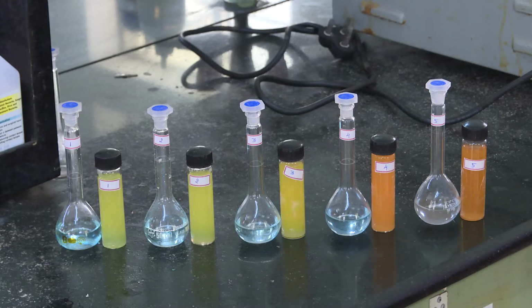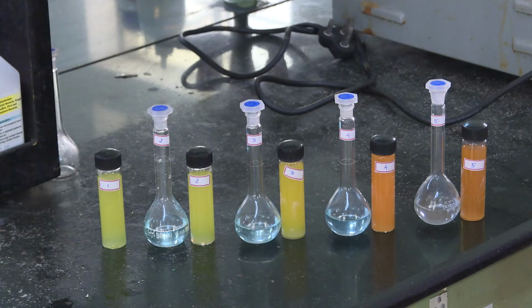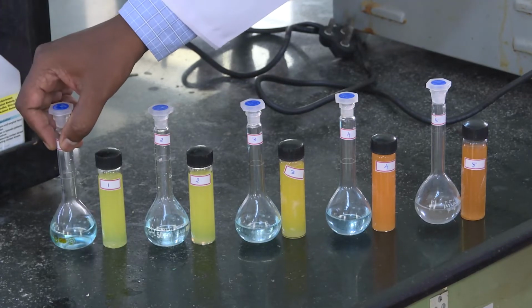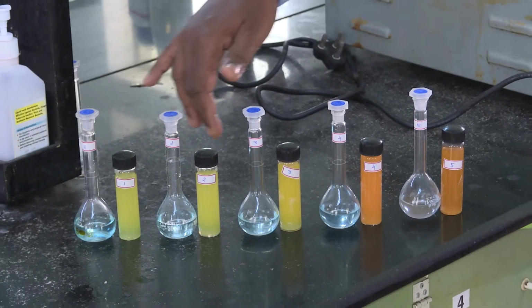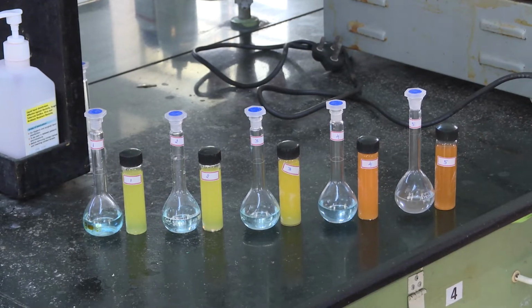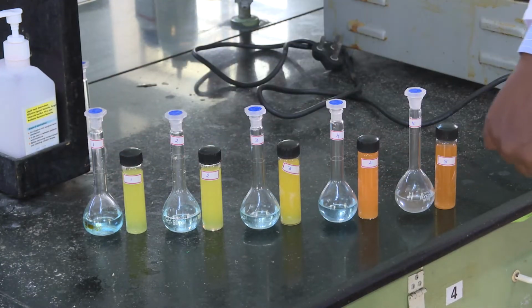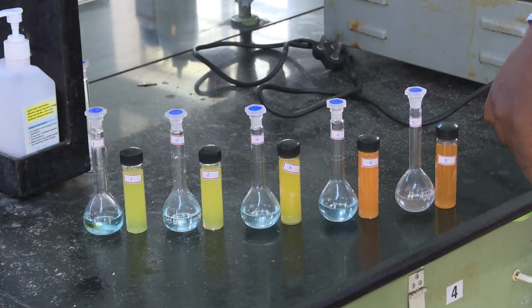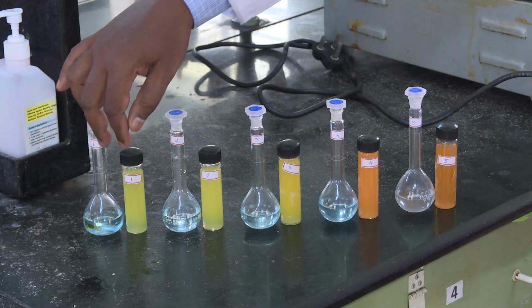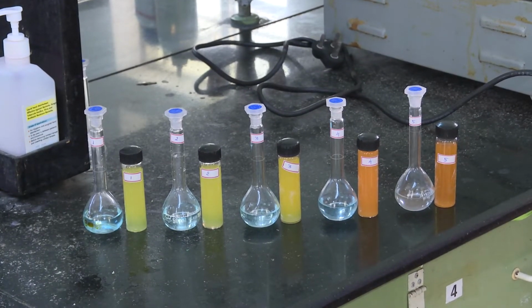Okay guys, after 5 minutes in the water bath, you can see that the Benedict solution, which was originally bluish green in color, has changed color for all of them after heating. From the lower concentration of sodium hydroxide, the color goes from yellow to reddish. And we can also say that the particle size varies. Okay, now let's go to the second part of the experiment.